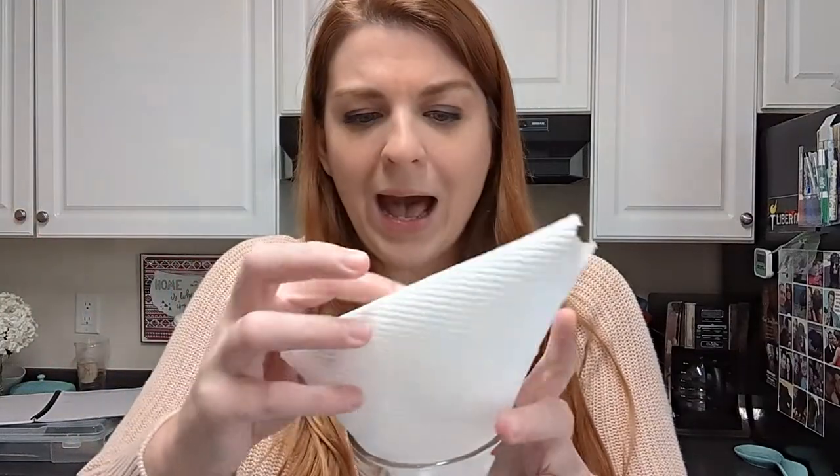So you're going to decide on the number of objects that are going to be in your bundle. I suggest you call them like your last name — so like Smith bundles. What you're going to do is take beakers and paper towels to hide your bundles of objects, or you can put your bundles of objects in plastic shopping bags or even paper lunch bags.